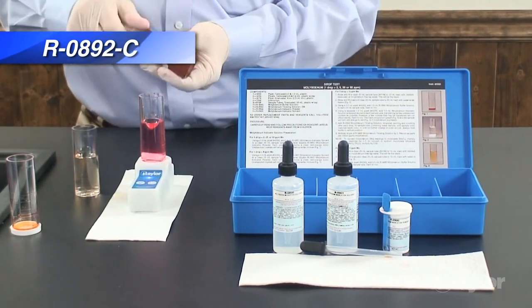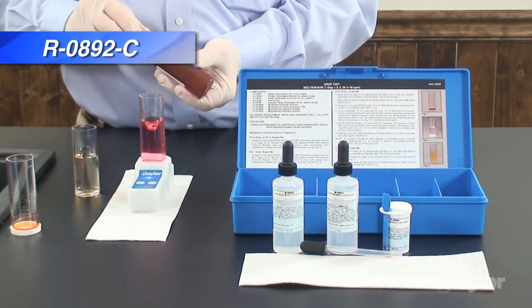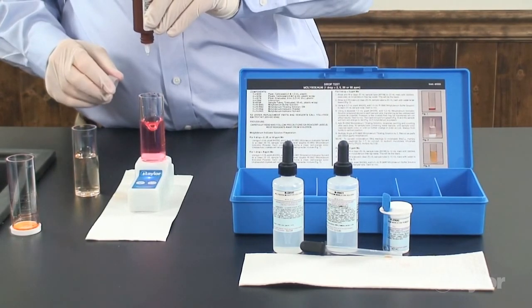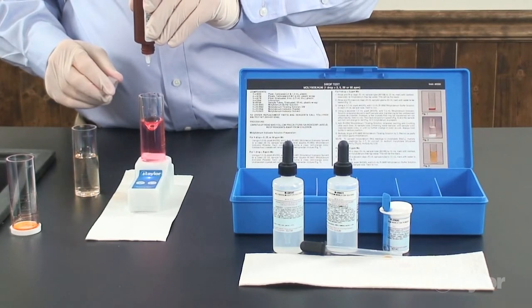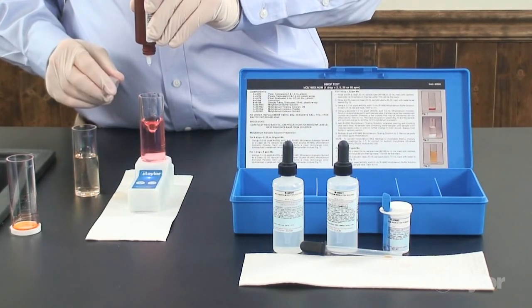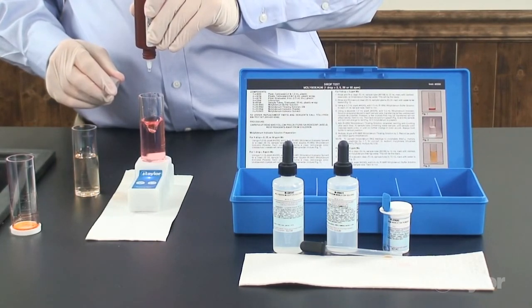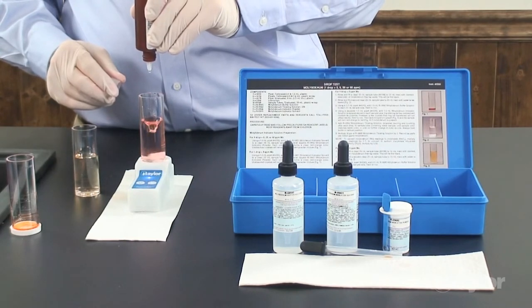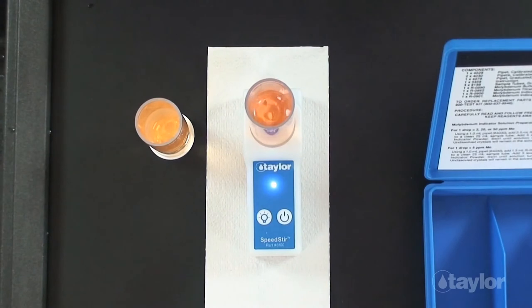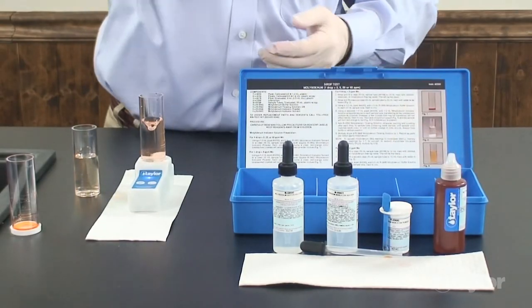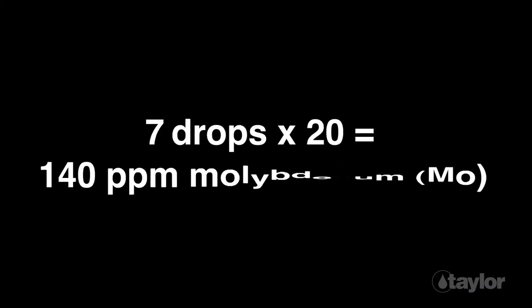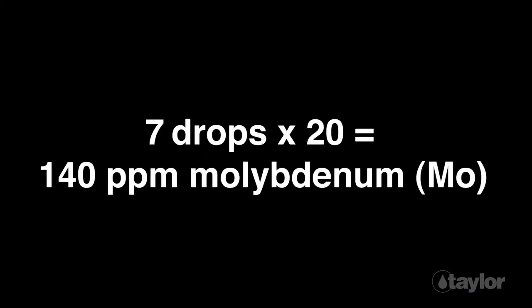Holding the bottle vertically, add molybdenum titrating solution drop-wise to the sample tube containing the water sample, swirling and counting after each drop. Continue to add drops until the color matches the sample tube containing the blank, or until no further change in color occurs. Multiply the number of drops of molybdenum titrating solution used by 20, and record the result as parts per million molybdenum.